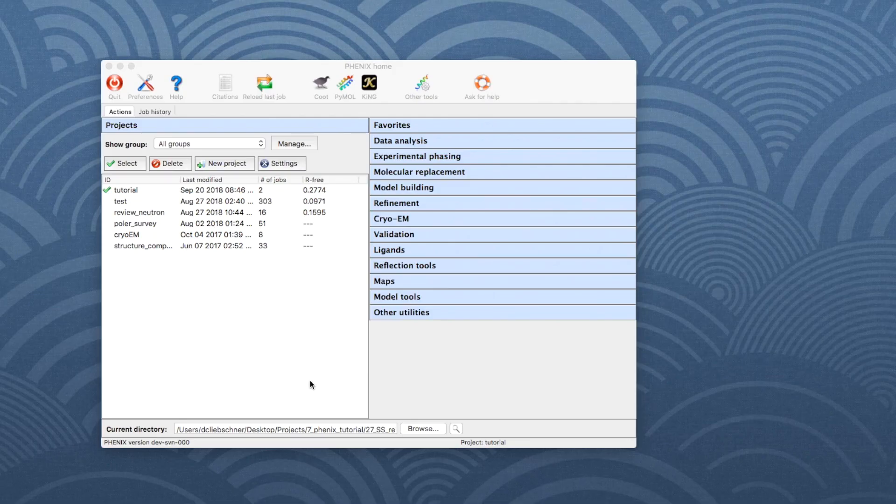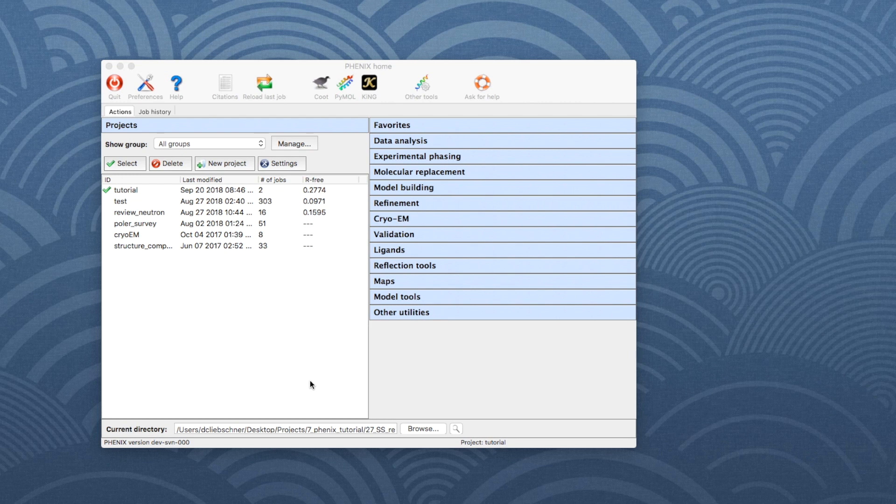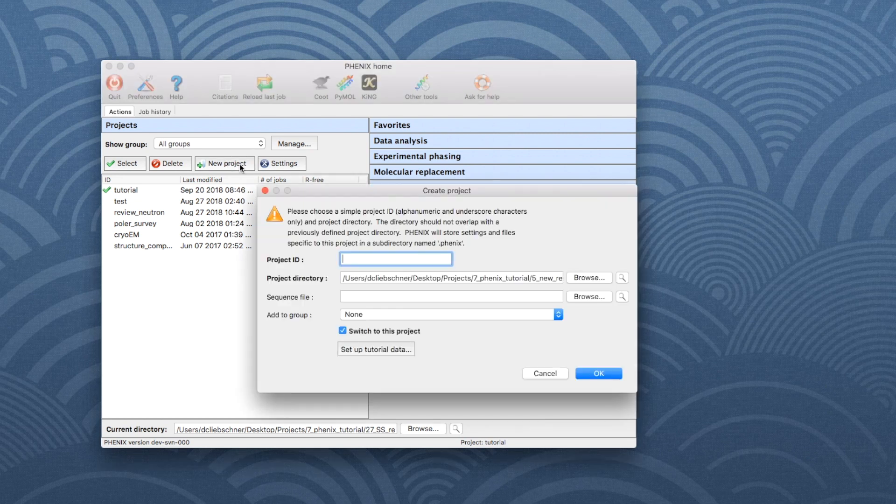The data for this tutorial are available from the example datasets which come with the PHENIX installation. To set up the tutorial data, open the PHENIX GUI and click on New Project.